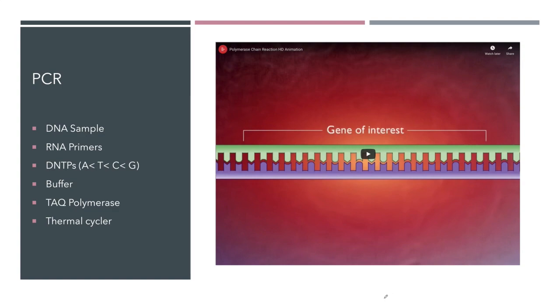In this one, we're going to look at another really common biotechnology tool called PCR. And I rewrote this lecture because there were a lot of changes in the textbook. And one of the things I wanted to incorporate, since we're in this remote learning environment because of COVID-19, was to show you how the testing for COVID-19 is actually done.